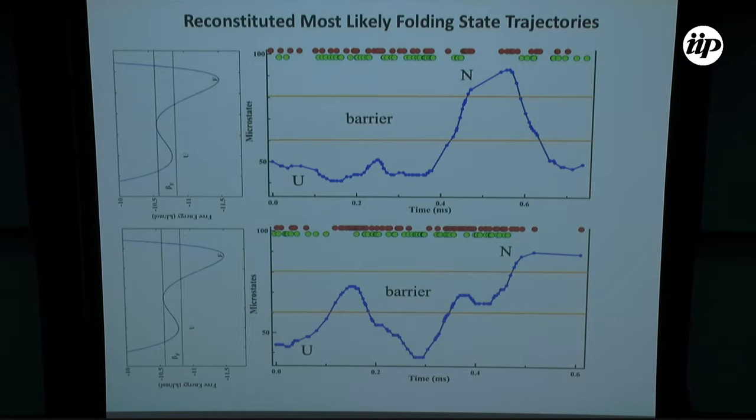Well, it's a maximum likelihood analysis, right? So already what you're getting is the most probable thing. And estimating anything else is pretty hard with this type of analysis. So you can get the most likely trajectory, but getting distributions of behaviors, there is no easy way to quantify that.